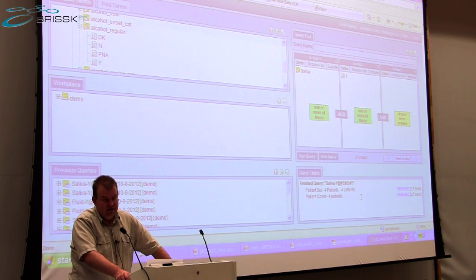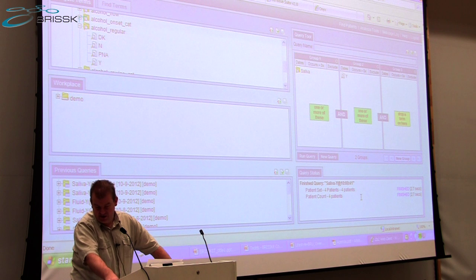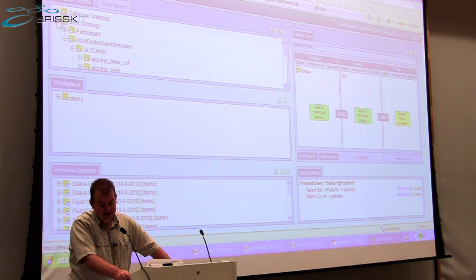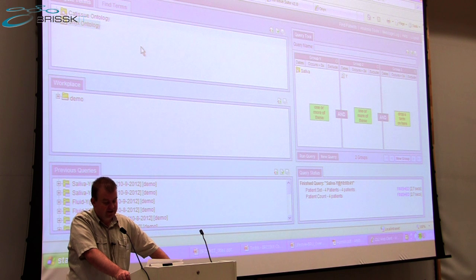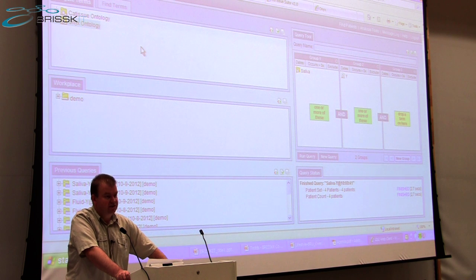Again, for the specific BRU deployment that we have in BRICS, we've got not simply the two ontologies. Olly, can you just show in the terms again at a very high level? So you can see that at the highest level in this instance of I2B2, there are two ontologies constructed. One for data deriving from CA tissue around what samples have we got and where are they, and one from data generated by the Onyx questionnaire.